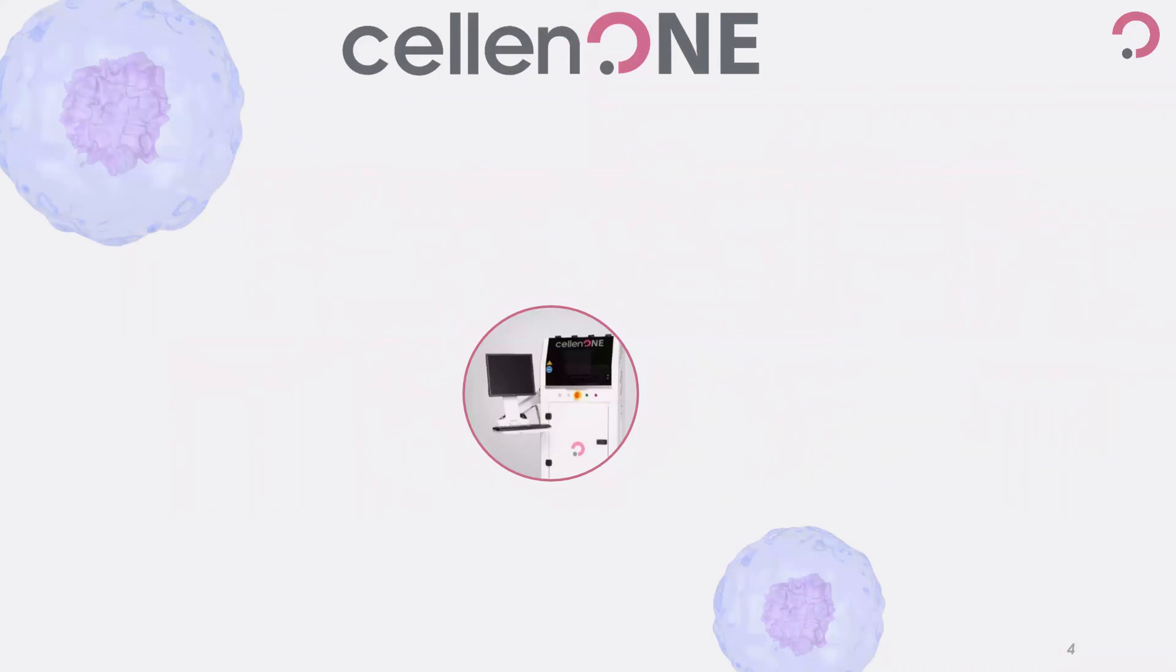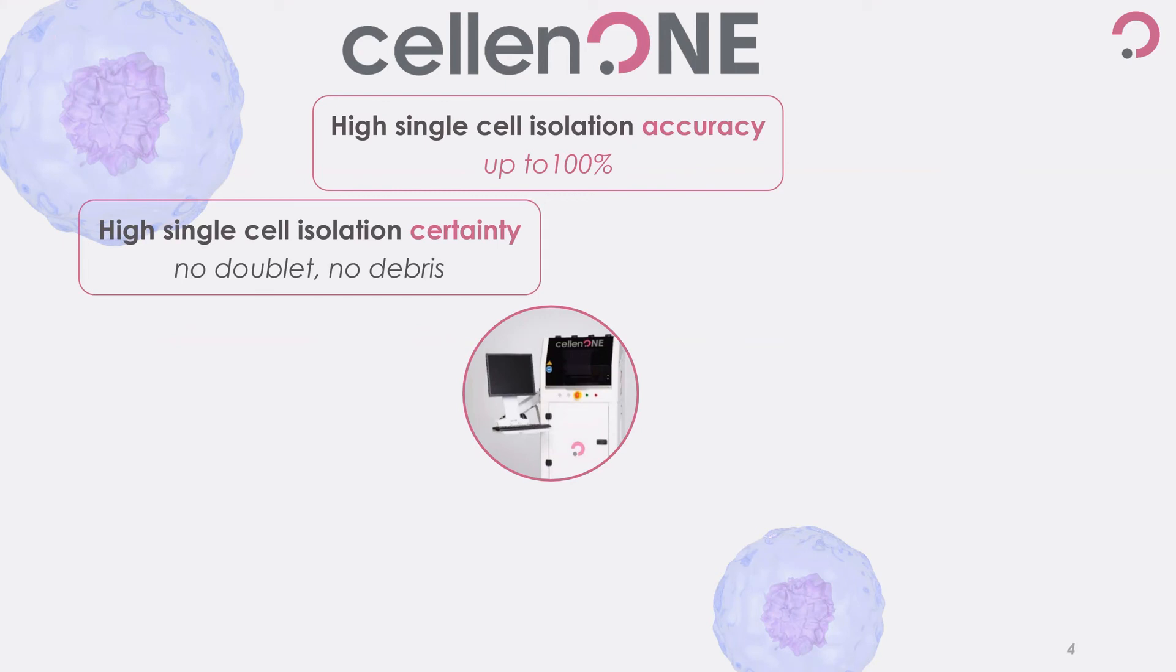In conclusion, the cell-in-1 is a highly accurate single cell isolation tool capable of avoiding isolation of doublets and debris and gentle enough for post-cell isolation cell growth of even the most delicate cells.